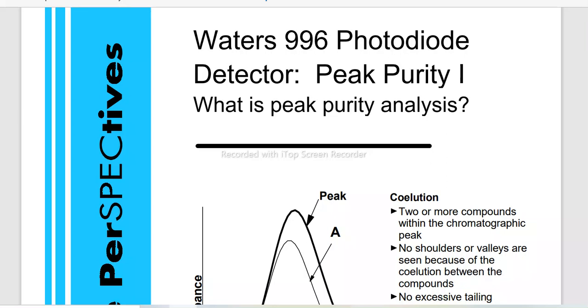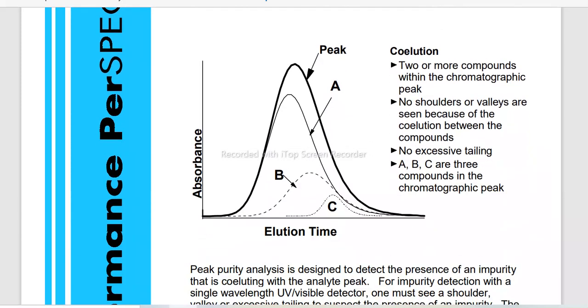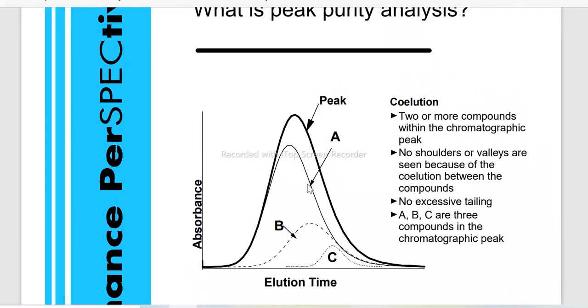What is peak purity, why we perform it, and what is the purpose behind this. Okay, so now let's get started. What is peak purity? Okay, now first let's see this graph.